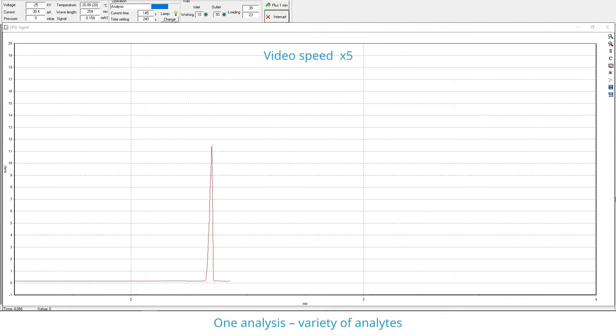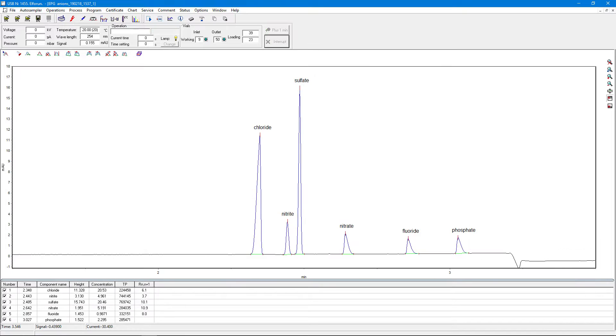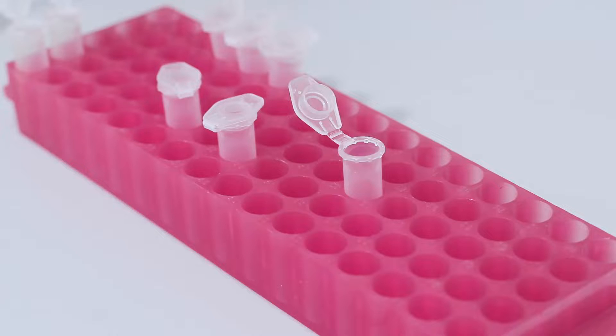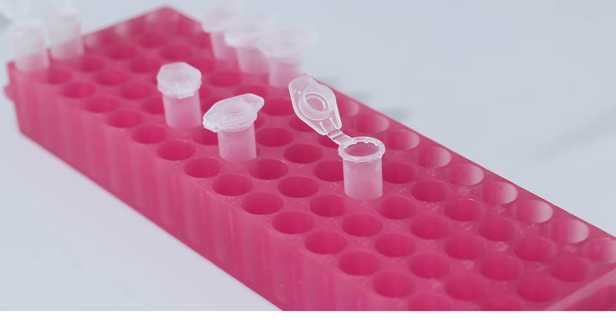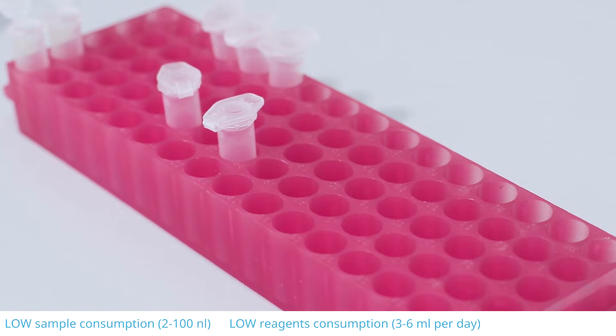Its efficient electrophoresis separation technique provides fast determination of multiple components in one run. The analysis time is typically just five minutes. Another advantage of CAPEL 205 is low analysis cost, thanks to very low sample and reagent consumption, in addition to the affordable consumables.